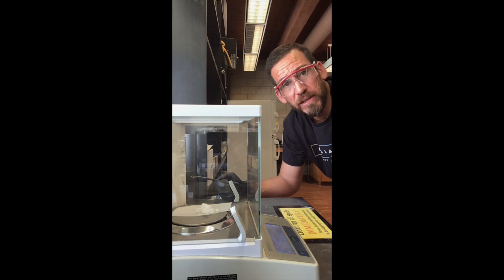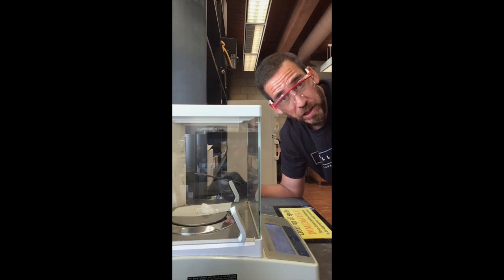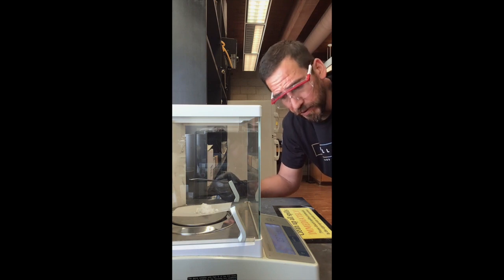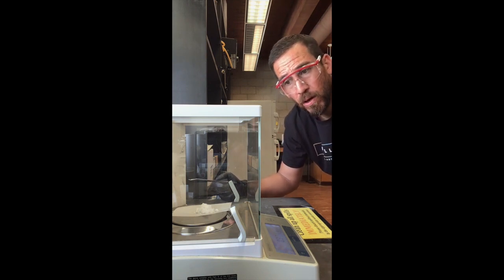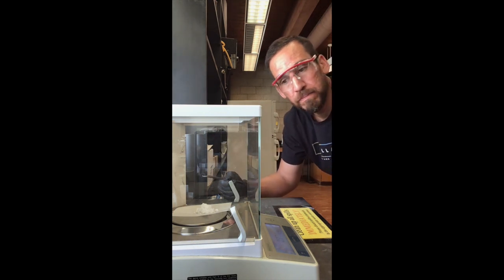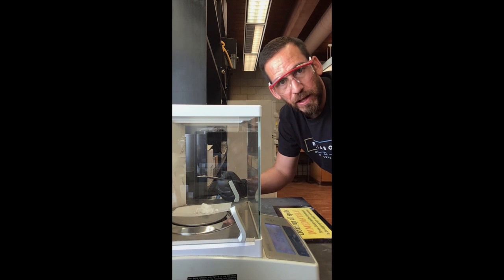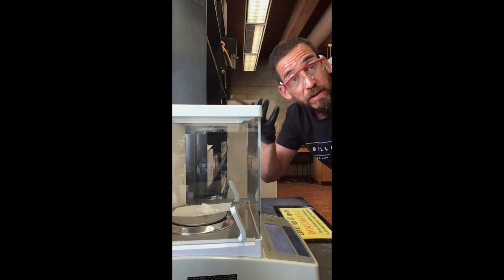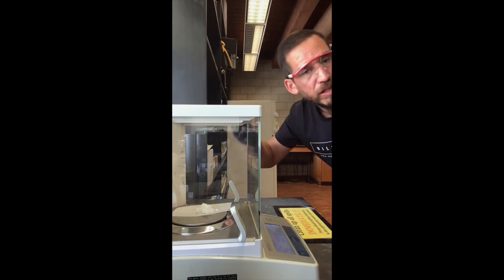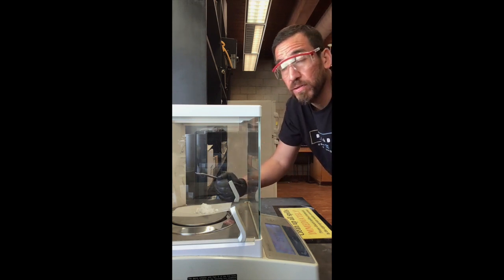If it was something that you spent like 6 months making, and now it's going to cure cancer or something, then you might want to go back and recrystallize that again to get the most out of this whole process, right? So it's just going to depend. Or what you can do, if this is something that you do all the time, let's say you did this reaction 5 times a month. Well, if I combine all of this stuff with the other stuff after the 5 reactions, that's another 500 milligrams, right? And so I can combine all of those into one batch and then do a recrystallization at the end of the month, and then boom, I got another 370 milligrams, right? Or 373, whatever it is.